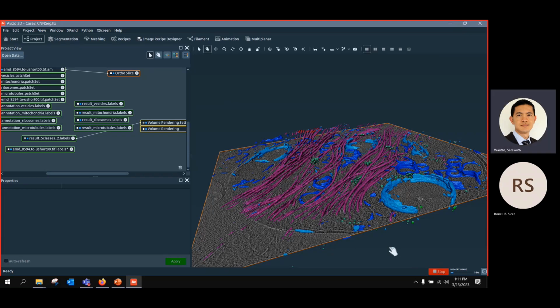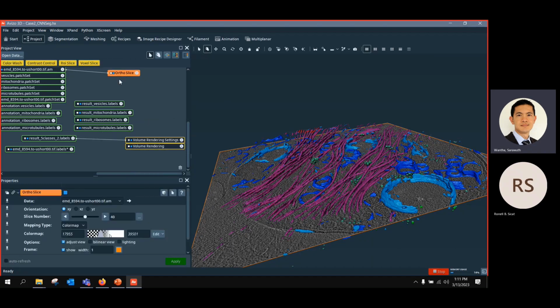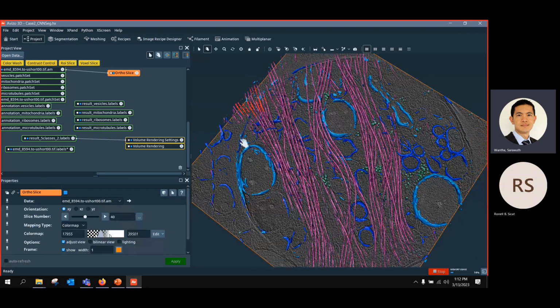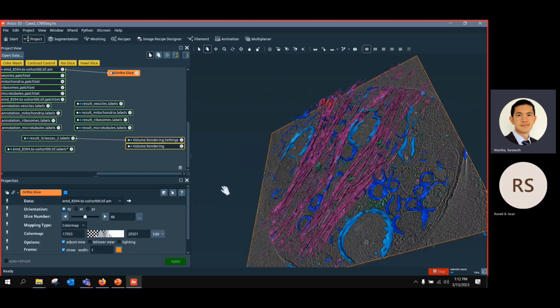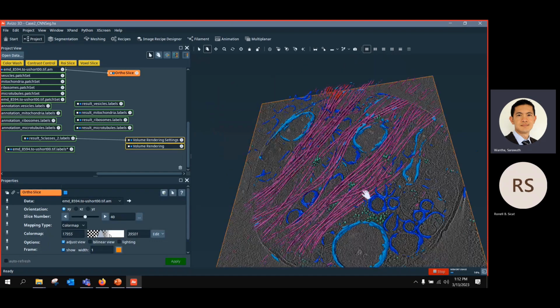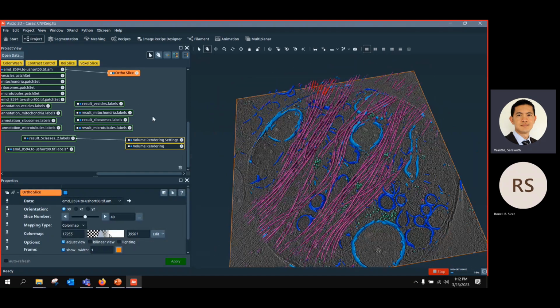Thank you. So that is about the AI-assisted tool. We have this data deposited on the website, and if you like, I can send you this complete project to give you an overview of what we did. I didn't upload the full project, so the data, but I can later deposit the complete project, and you can see this.